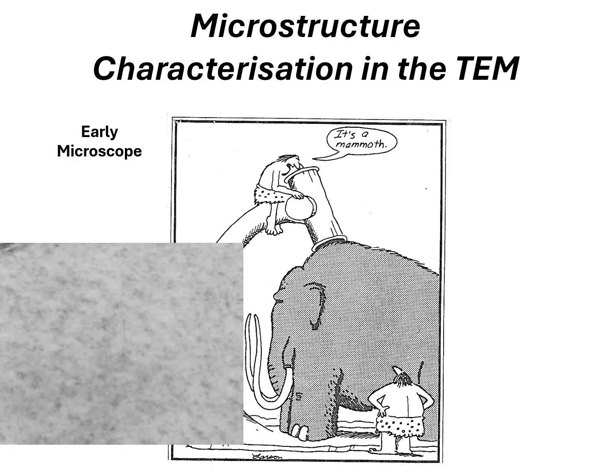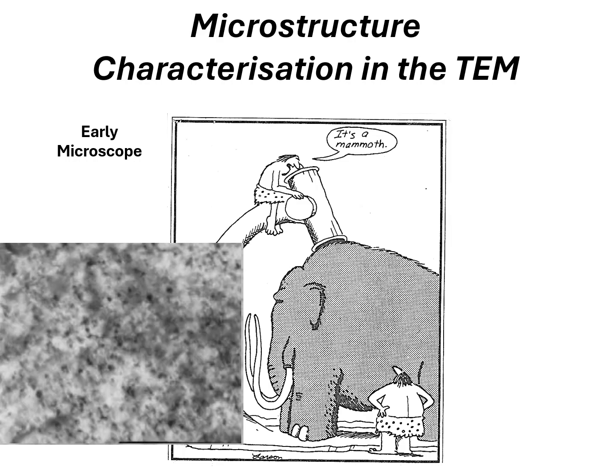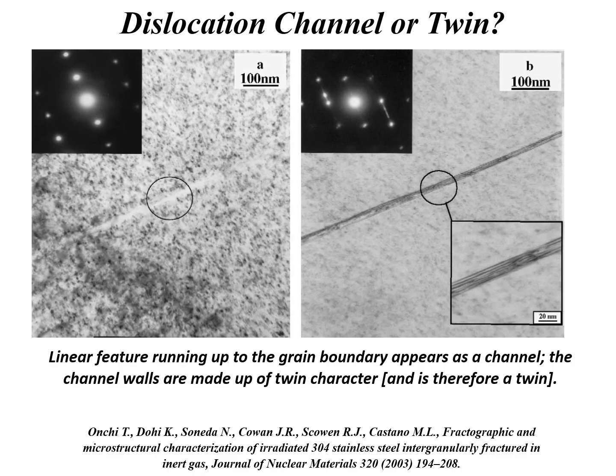And I said, "Well, I can see that there is something there. And what are your diffraction conditions?" And he didn't know what I was talking about. So I put it into diffraction mode and tilted the sample a little bit to get stronger contrast. And I said, "Oh, well, you have damage, and there it is." Now, I don't have those actual images from that day because it was a one-off, on the spur of the moment. But these images I'm just showing you are pertinent to current day.